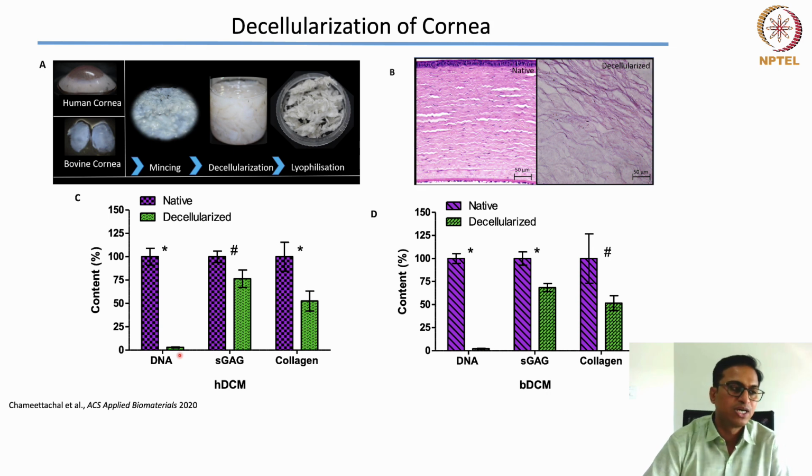So it is well below the limit of DNA that is acceptable for a transplantable material. So we have successfully decellularized this cornea with our developed process.